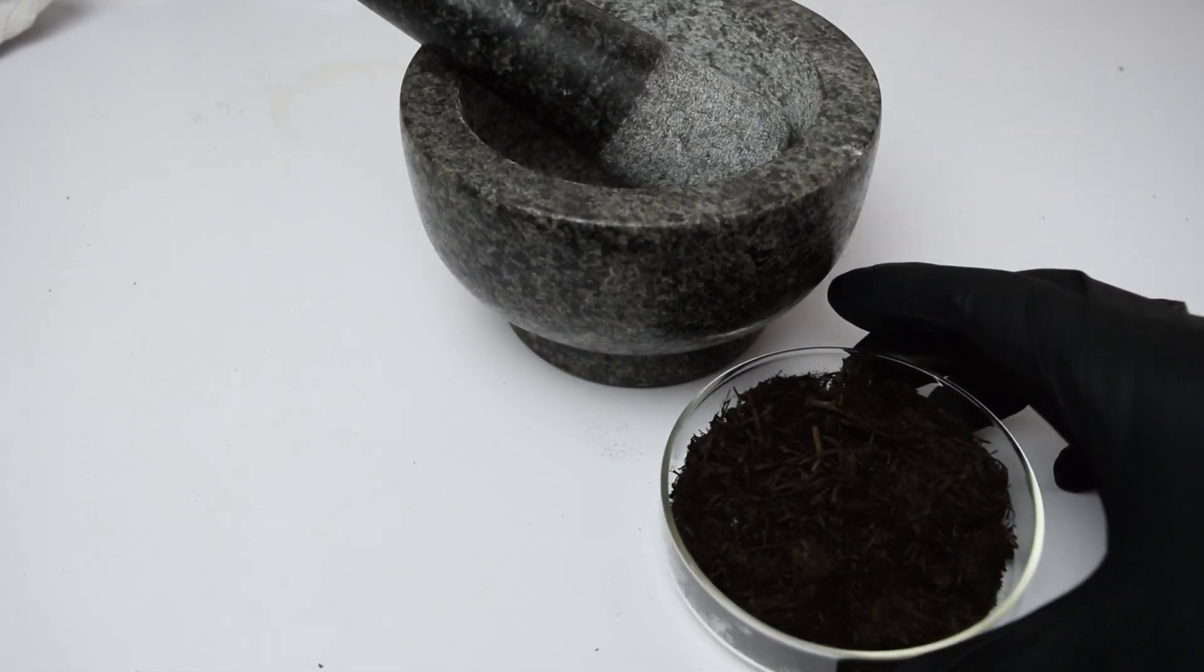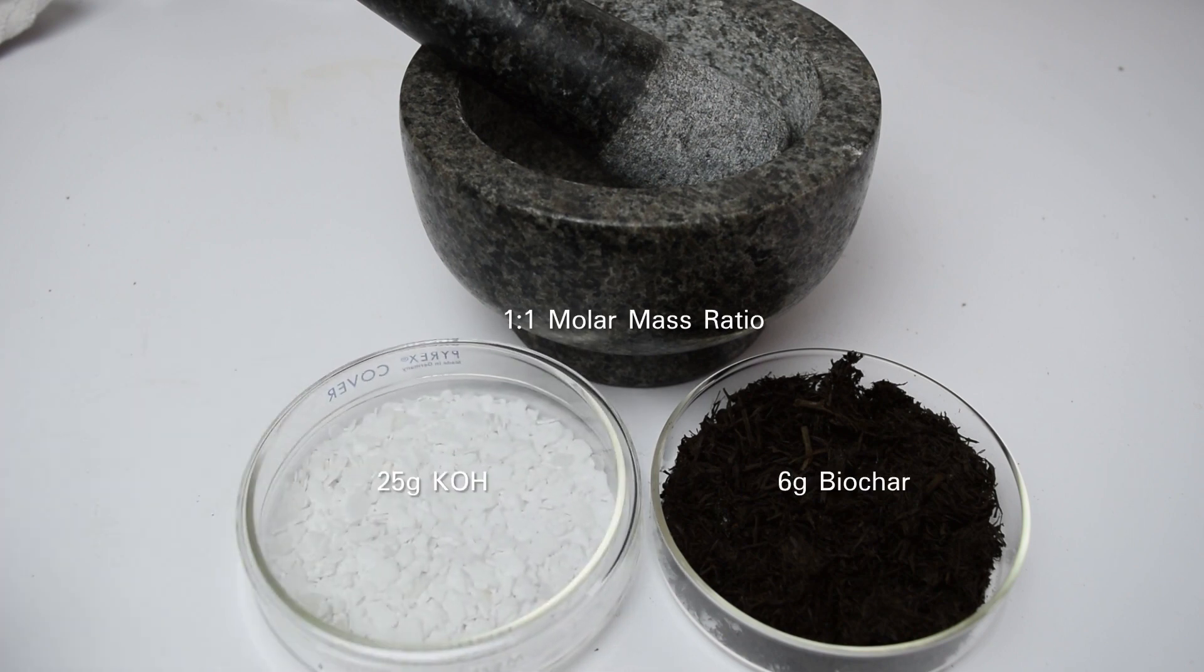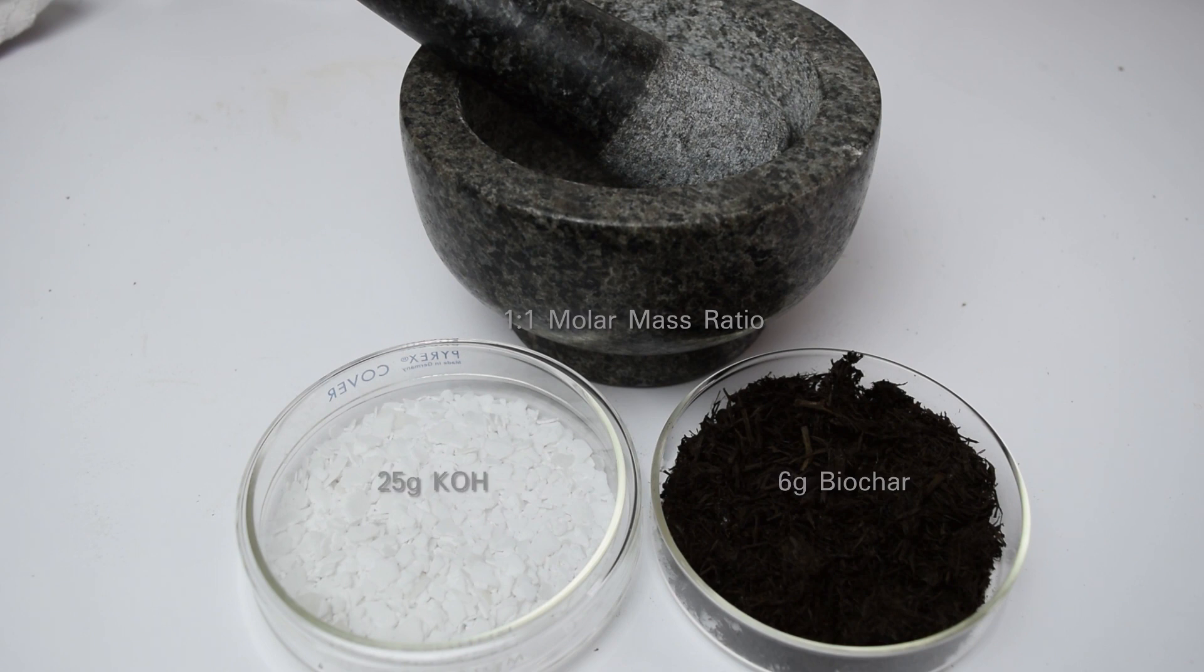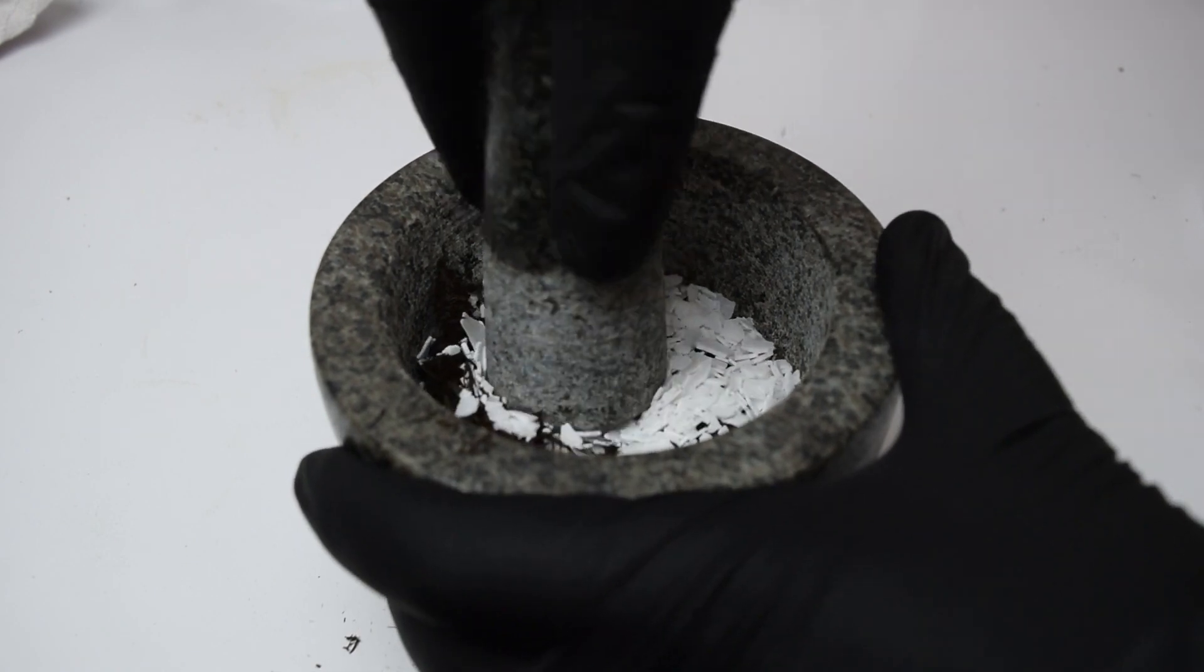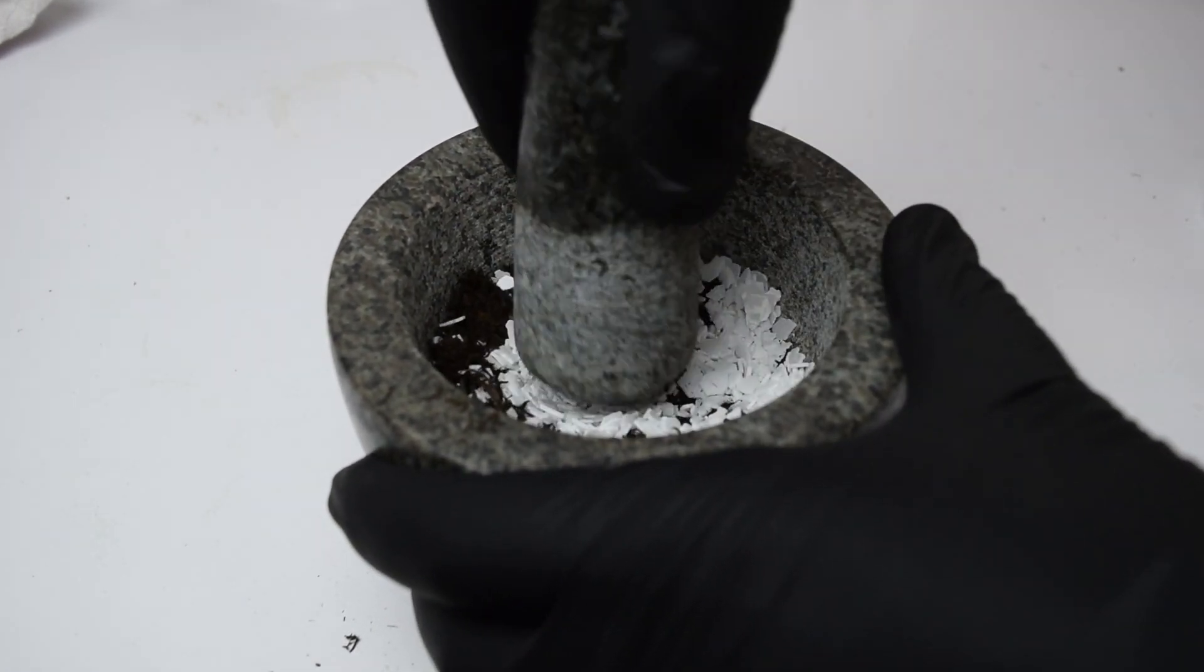After the biochar has dried, it needs to be mixed with potassium hydroxide in a one-to-one molar ratio. Here, I have 6 grams of biochar and 25 grams of potassium hydroxide. Biochar is about 75% carbon and 25% oxygen. They are then combined and ground with a mortar and pestle.